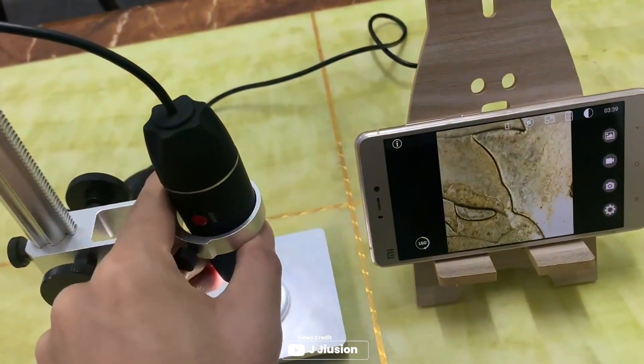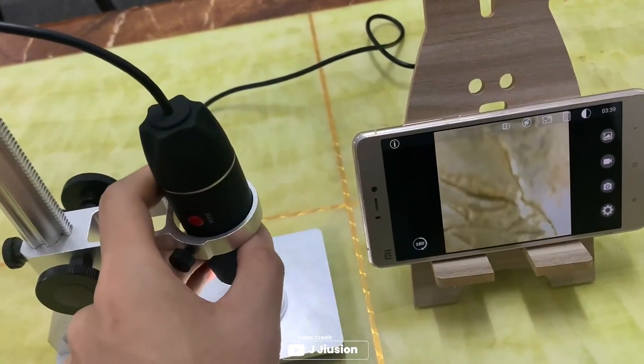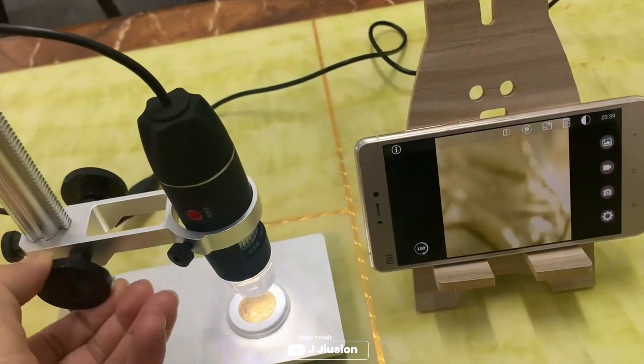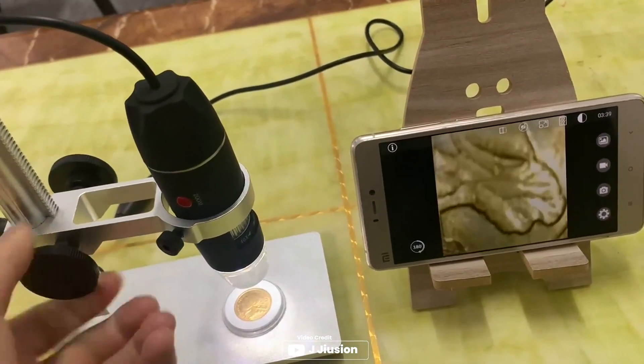Windows XP, Vista, 7, 8, 10, 11, Linux, and Chrome OS. However, it is not compatible with iPhone or iPad. It supports Android smartphones that have OTG function. To check if your smartphone has OTG, download the free app USB OTG Checker.